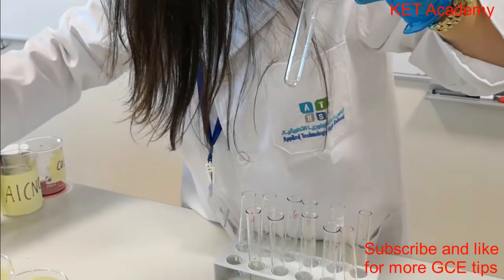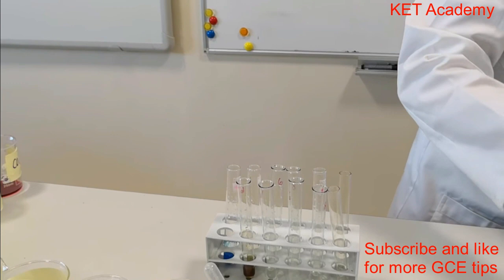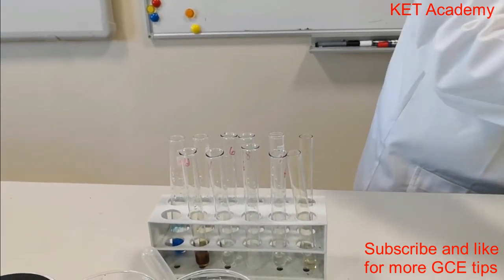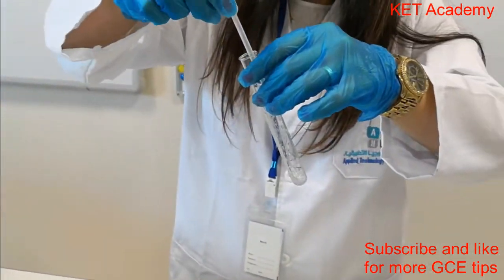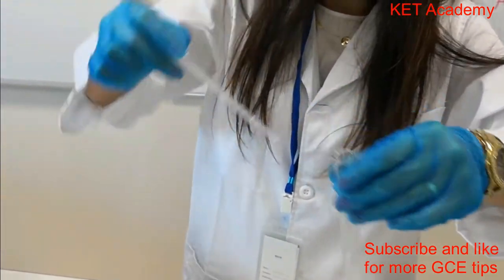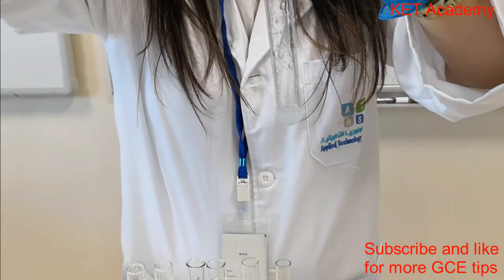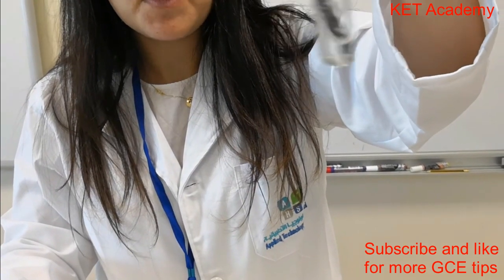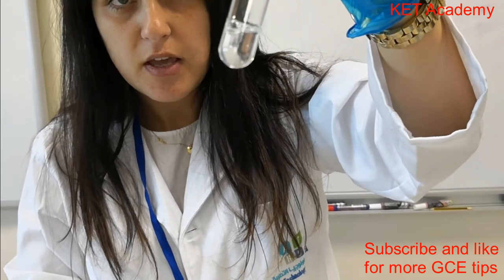Now the zinc. This is a solution of zinc. Let's put some more zinc. With sodium hydroxide, it forms a white precipitate, but with excess sodium hydroxide, this white precipitate redissolves.